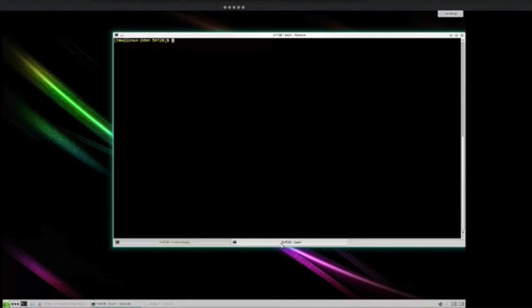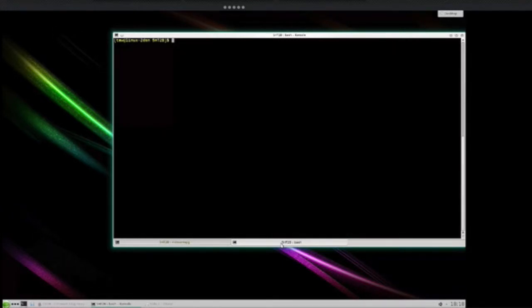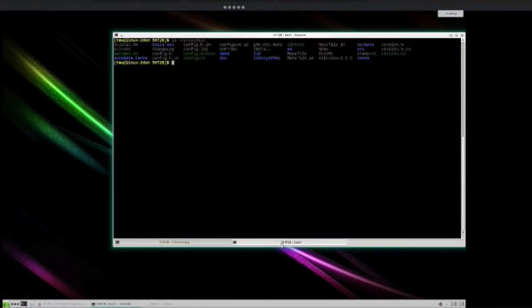Now there are helper scripts in the CrystFEL download folder for this purpose. This is the folder that you got when you downloaded and unpacked the CrystFEL software itself. Even if it's pre-installed at whatever site you're working at, it's a good idea to download it yourself anyway, so you can get those scripts. You can also find them on the website if you don't want to do that. In my case, that's in the home directory, CrystFEL. So have a look in there.